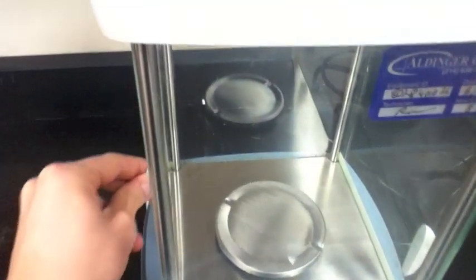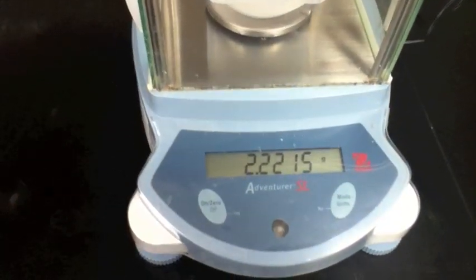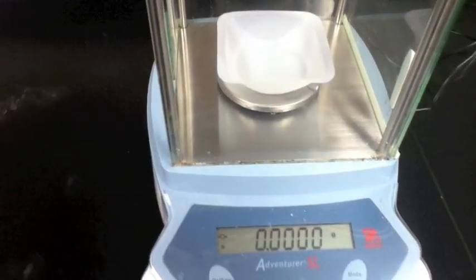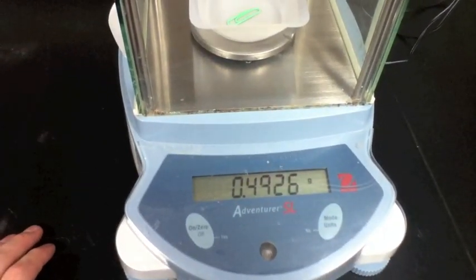Now I'm ready to obtain the mass of my paperclip. Sliding the door open, I can now place the weigh boat on the balance itself, and I close the door once again for accuracy. I press the on switch to zero out the weigh boat, and I'm ready to place my paperclip on the balance. As I place it on, I close the door, and now I obtain the mass of my paperclip.